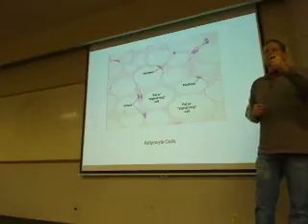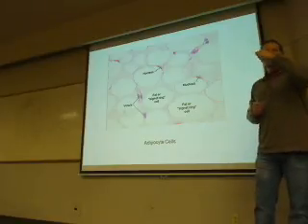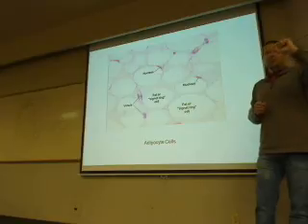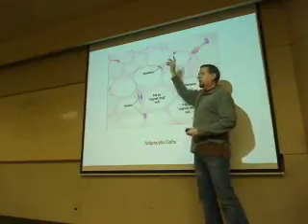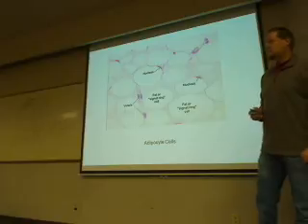When he wanted to seal a special letter, he put some wax on there, stuck the ring into the wax, pulled it out, and it had his symbol in there. That was his signature, and it was called a signet ring because of that. So these were called signet ring cells because of the nucleus that stuck up. Then at some point somebody figured out that they were fat cells, and they were called adipocytes after that.